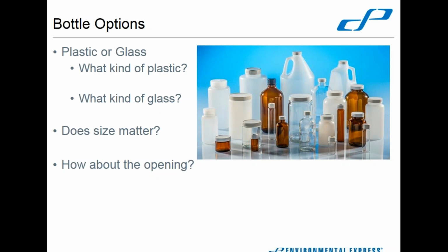So that's got a lot of updated information in it, clarified certain holding times, clarified some temperature requirements, and so forth. But just about everything that they have listed as far as the container type breaks down into plastic or glass. And for most samples, plastic or glass is perfectly fine. Either one is acceptable. It really doesn't matter what you use. It just depends on your preferences, your lab preferences, the purchase price, whatever kind of criteria makes you happy. Generally, it's fine to use plastic or glass.